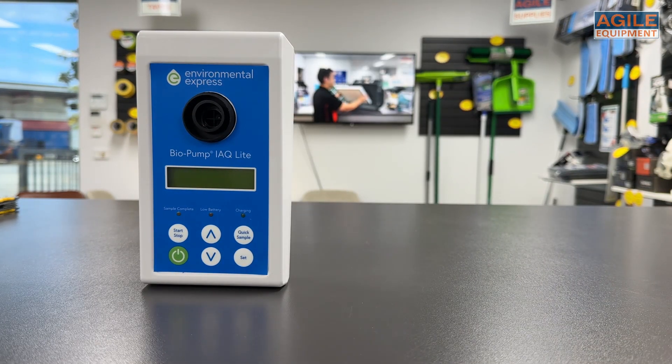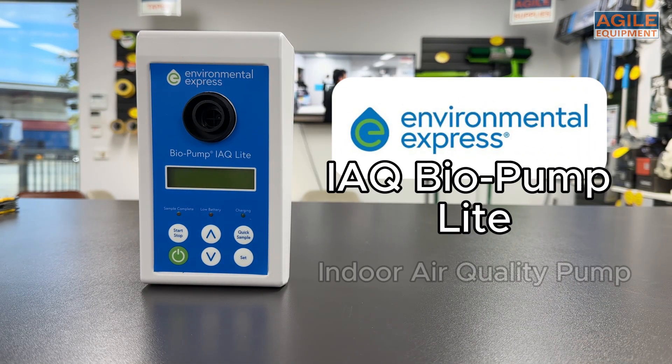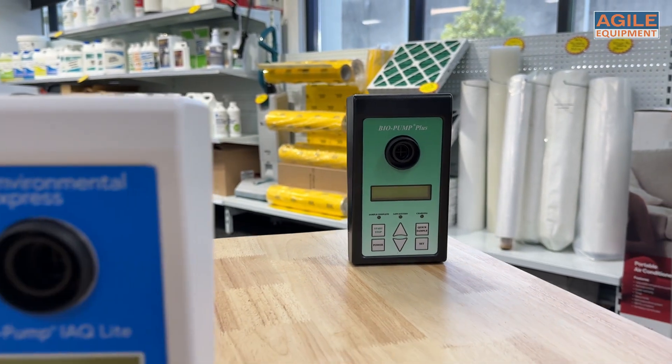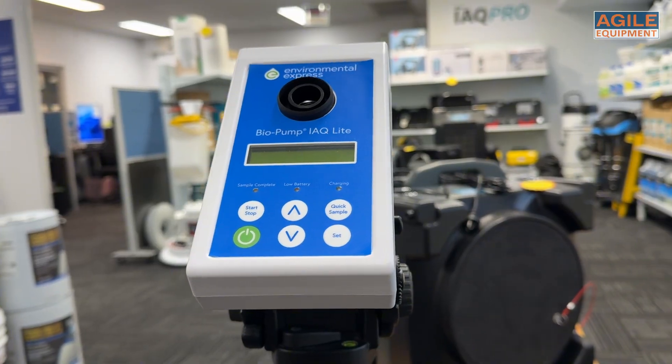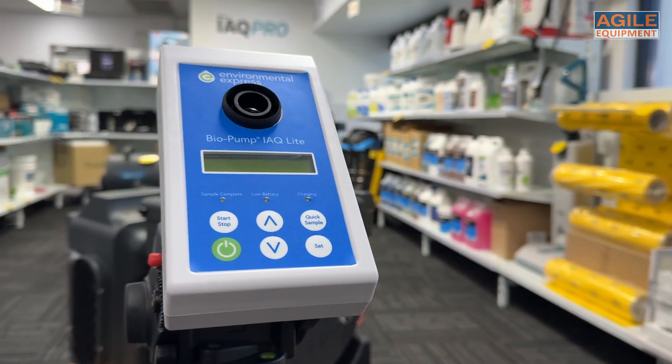Hey, check it out. Agile Equipment is now offering the new Environmental Express Biopump IAQ Lite. If you've been in the restoration industry for a while, you might recognize its predecessor, the Zefon Biopump, which has been a trusted name in mould sampling for over 20 years.